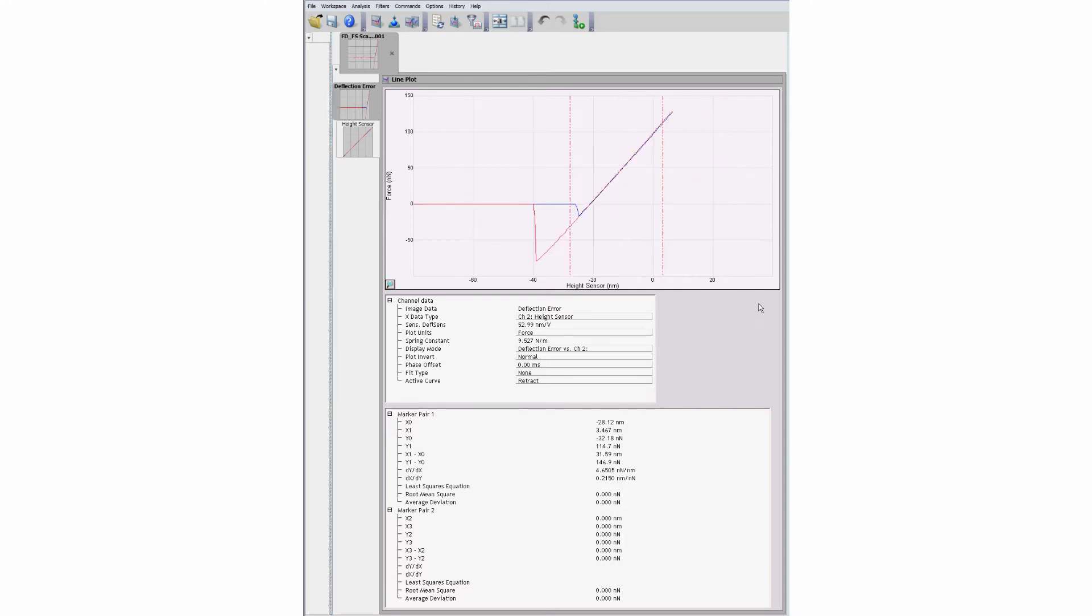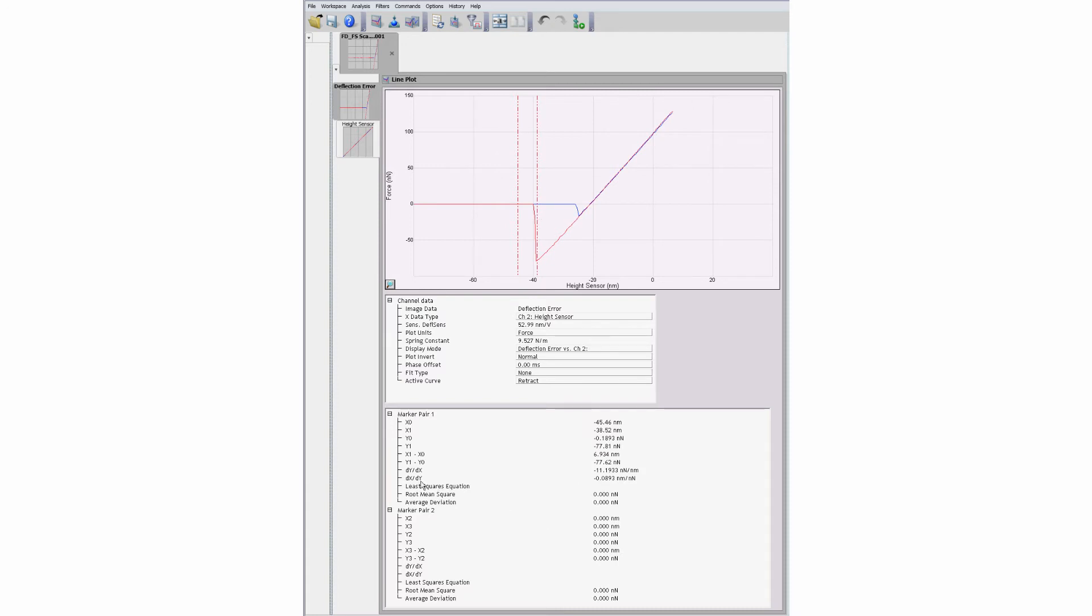To measure the adhesion force, set the active curve to retract, zoom in on the pull-away point if necessary, and move the cursors to either side of the pull-away point. The difference between the y-axis values reflects the adhesion force between the sample and the probe tip.